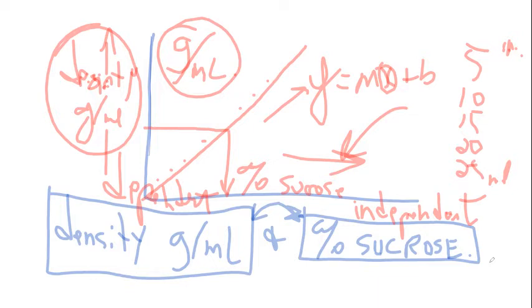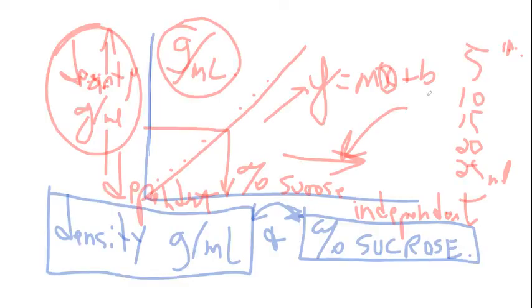I'm so confused on how you would find the mass of a beverage. By weighing it. Oh my gosh, I overthought it. Jeez Louise. My bad. I keep on doing that. Yep, by good old weighing it. Okay.